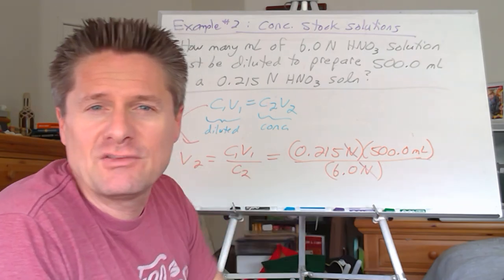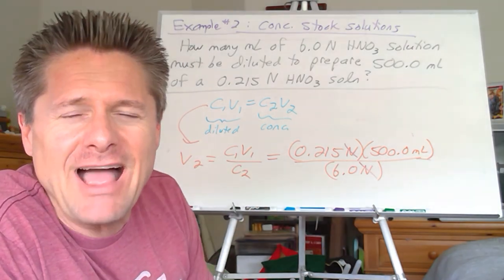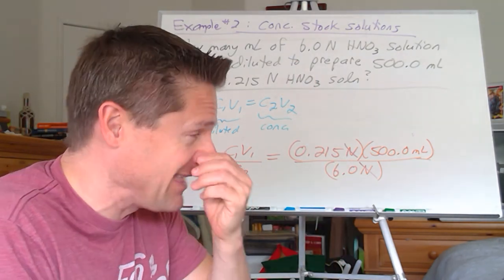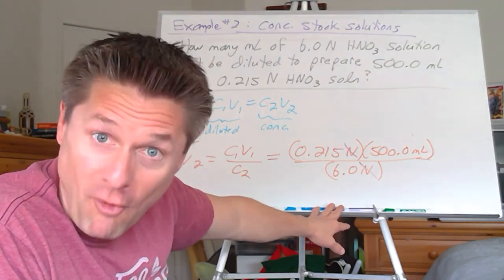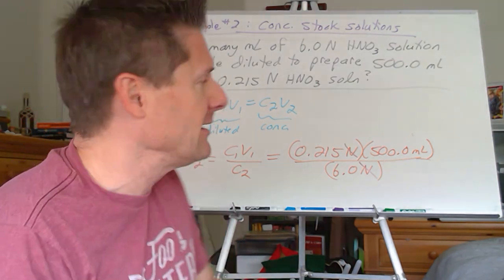We've got 3 significant figures in the concentration that we're after, and 4 significant digits, probably from the volumetric flask. But we only see 2 significant digits on the stock solution bottle. Can't somebody figure that out to more decimal places? That'd be better if that was known to at least 3, right? Preferably 4 would be nice.